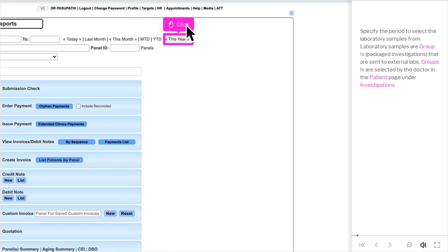Specify the period to select the laboratory samples from. Laboratory samples are Group 9, packaged investigations, that are sent to external labs. Group 9 investigations are selected by the doctor in the patient page under Investigations.